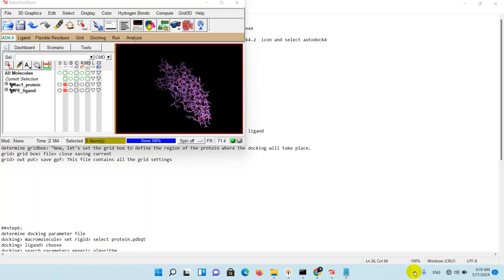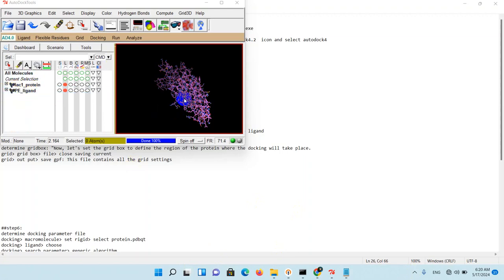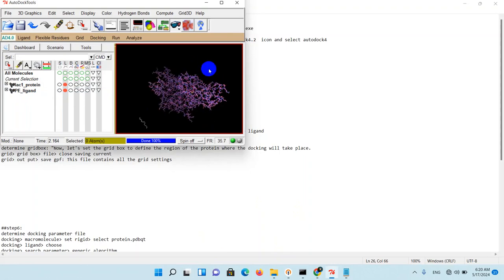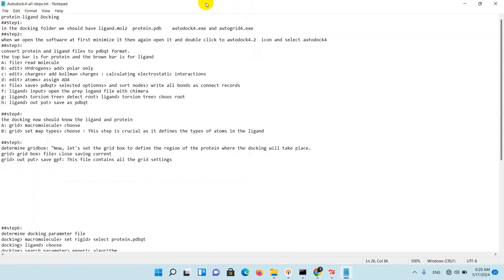So let's get started. In the first step, as you can see, we have our protein and ligand PDBQT file open in the application. Now you must show your software what is your ligand and what is your protein molecule.